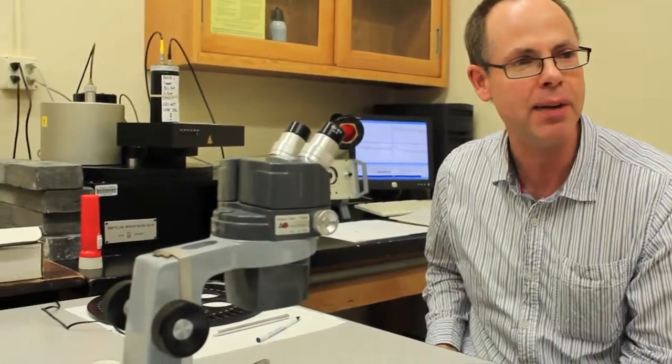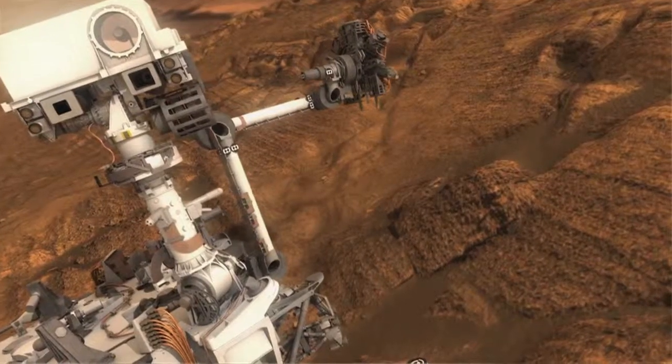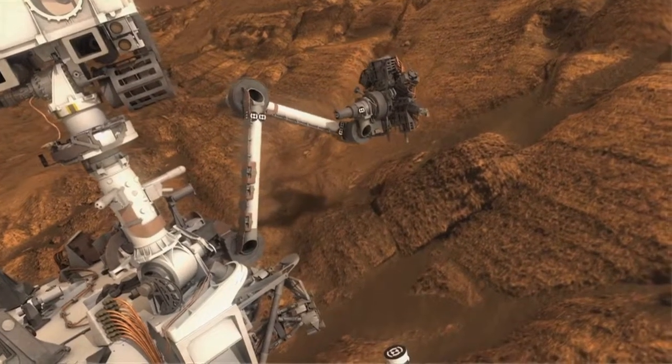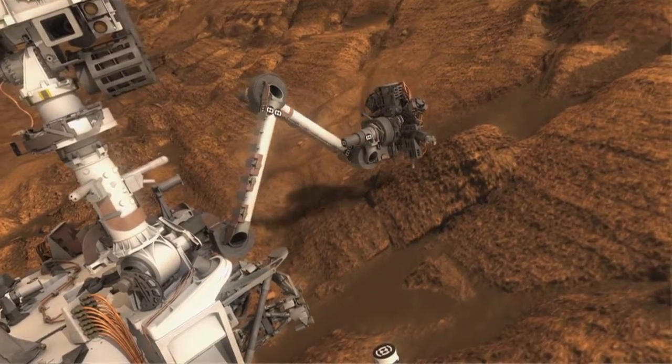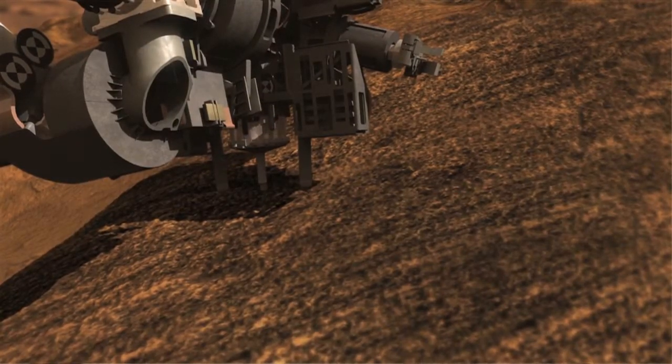So they may be taking place in between measurements that we can make, for example, by remote sensing, and we can get a better assessment of that by measuring it directly. So people are currently building systems not very different from this system here, but miniaturized, which will sit on one of the future Mars rovers, and a small sample from under the surface will be collected by a specially designed arm, taken into the machine, and that will be dated.